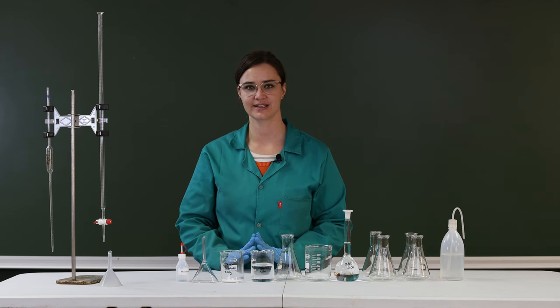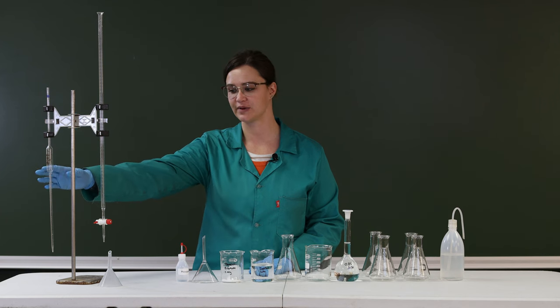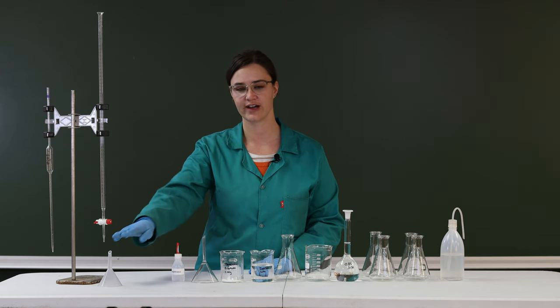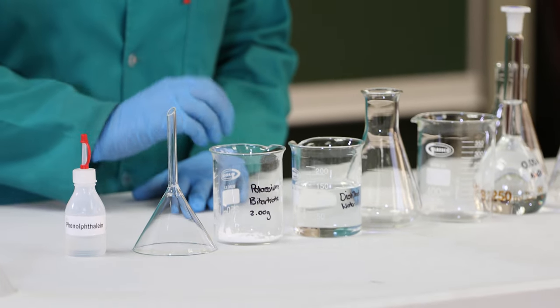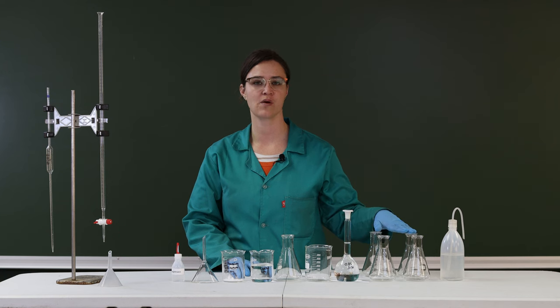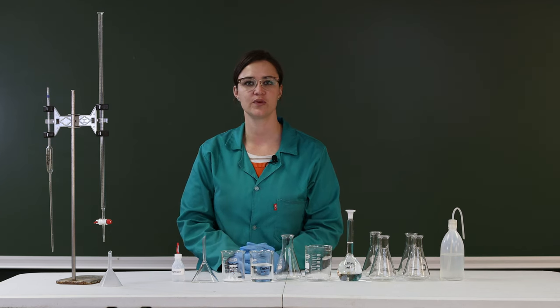Hi guys, welcome. This is practical three — we're going to be working with solubility and KSP. Going through the apparatus: on the stand we've got a burette and a pipette, our indicator for the titration, two funnels. I've already pre-weighed exactly 2.00 grams of potassium bitartrate into this beaker. We've got a 250 ml beaker with distilled water, four conical flasks for our titration, and our 0.05 molar sodium hydroxide solution.